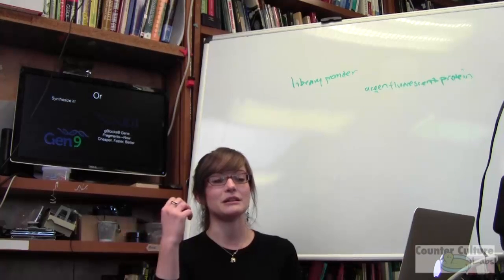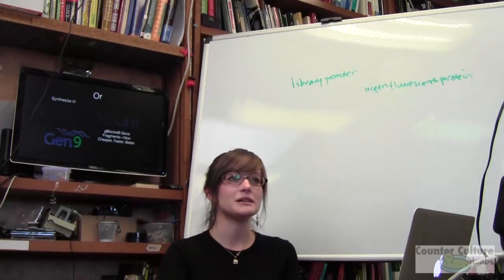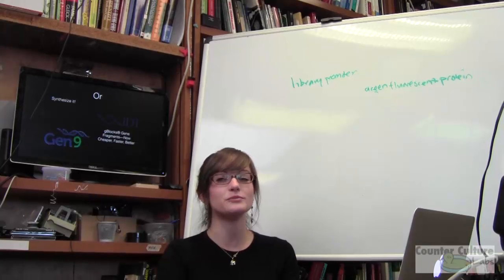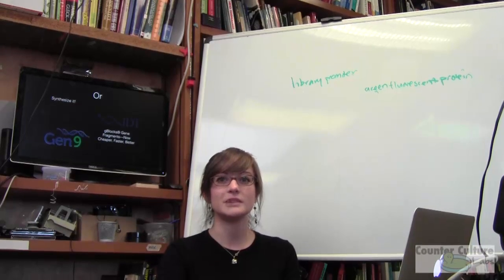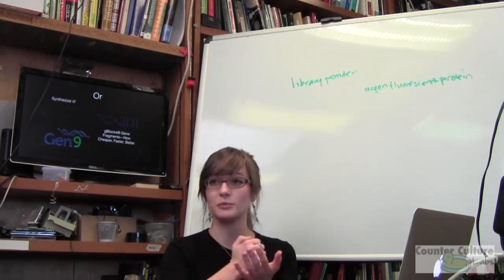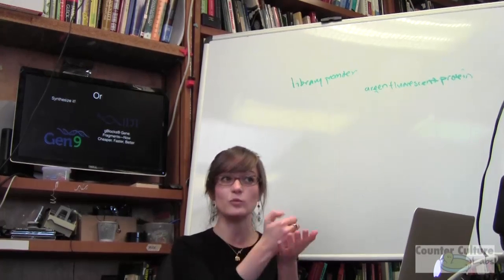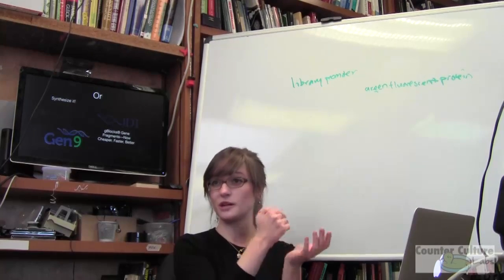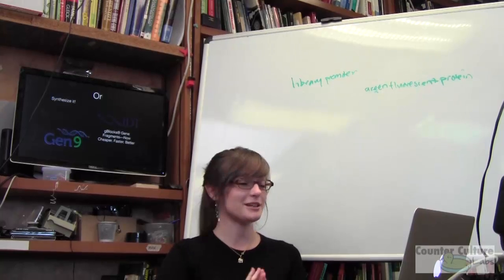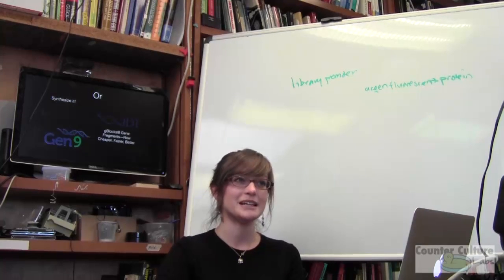And plasmid DNA, because it's a small circle, is very stable as well. Matt Cowell, for example, has been talking about sending plasmids across the country, just putting a droplet on filter paper. On a postcard. That's how I send plasmids to people, I just put them on a piece of filter paper. Then they take some water and pipette over the spot where I dropped the DNA and suck it up. It's surprisingly extremely hardy. You could literally put it on the back of a postage stamp.